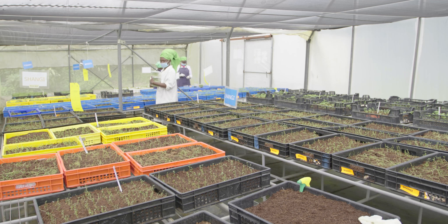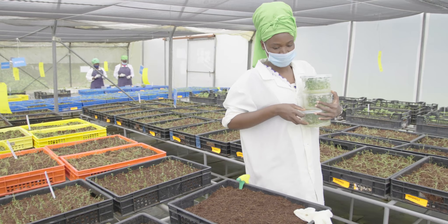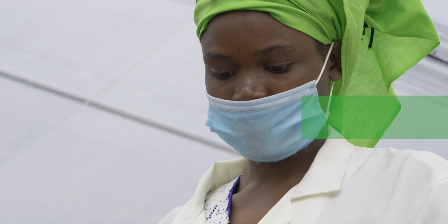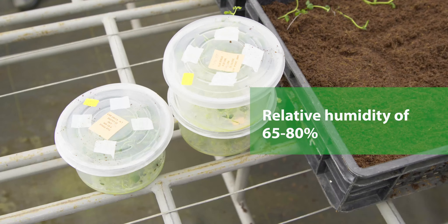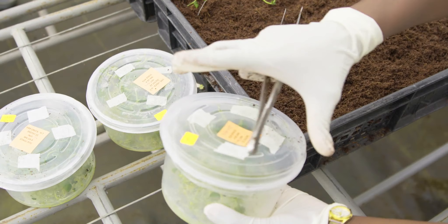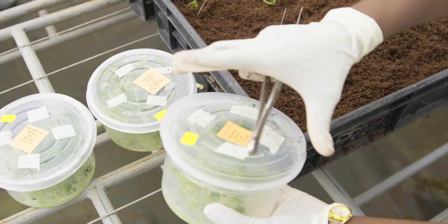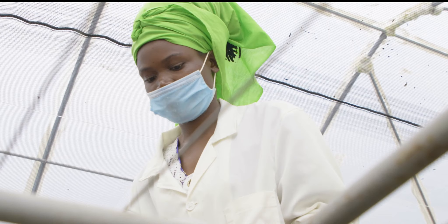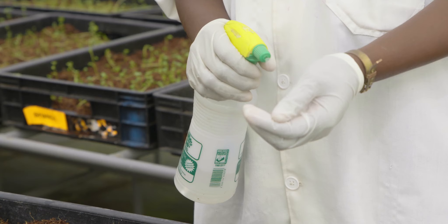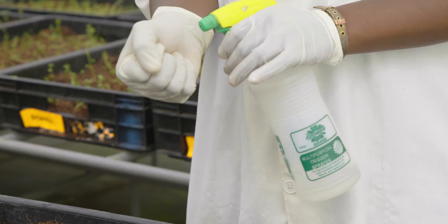When transferring the in vitro plantlets to the substrate media, you can minimize mortality by acclimatizing them in the screen house. Acclimatization is achieved by keeping tissue culture material in a low-light setting with temperatures ranging from 18 to 23 degrees centigrade and a relative humidity of 65 to 80 percent. After 12 hours in the screen house, partially remove the lid, then fully open the lid, leaving the plantlets exposed for 18 to 24 hours before transplanting. If plantlets show signs of shock, such as collapse of the shoot or scorching, mist with clean water then close the lids to hold back.